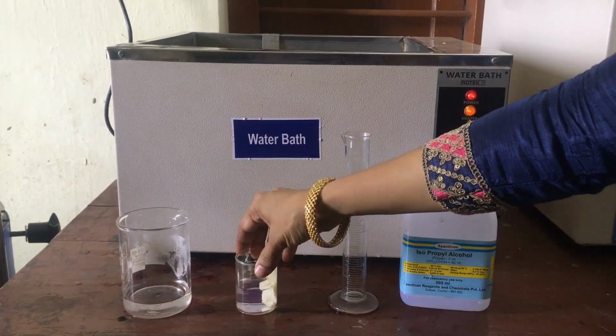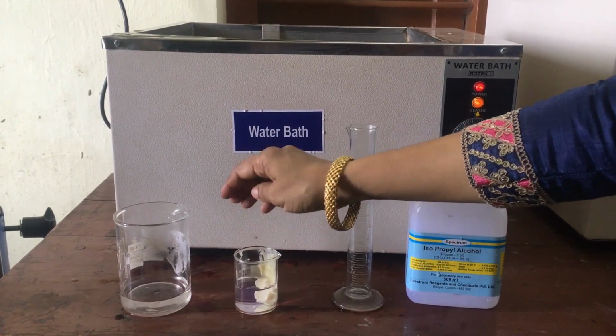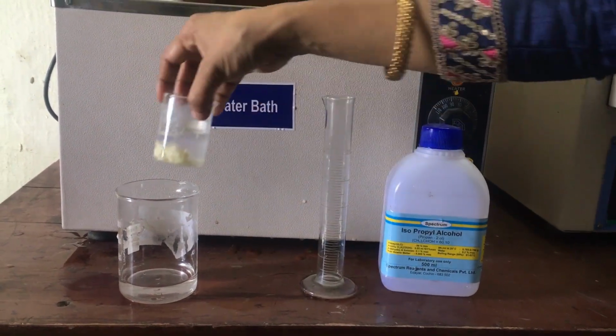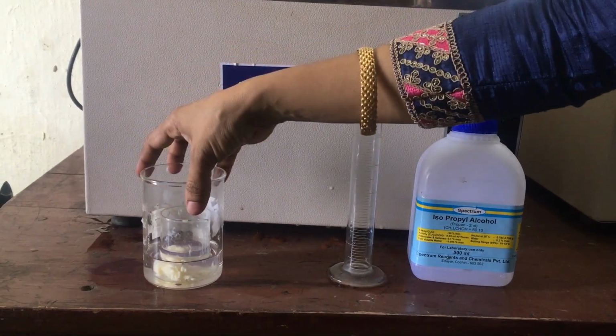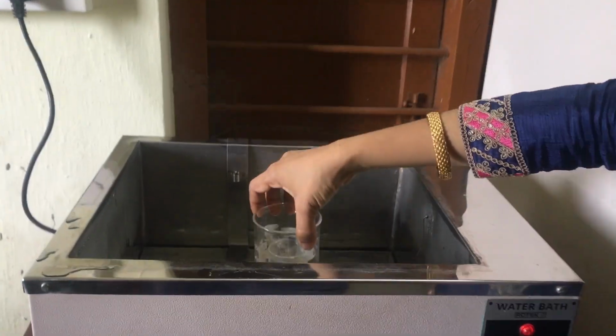At this time we should not let any butter stick on the side. Then we need to double boil it, by keeping it inside another beaker and placing it inside a water bath containing boiling water. Next, we wait a few minutes for the butter to melt completely.